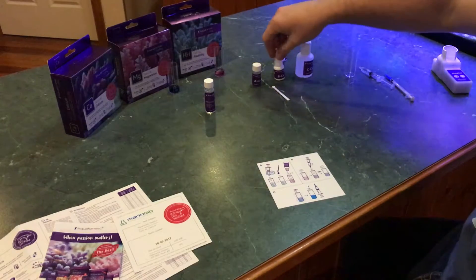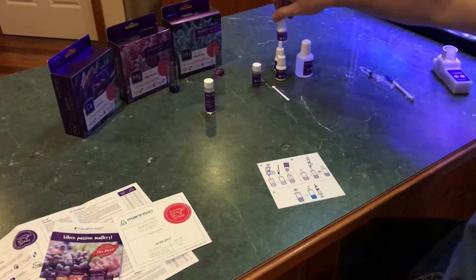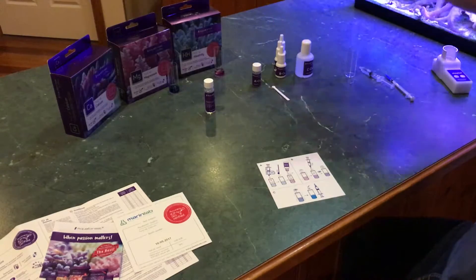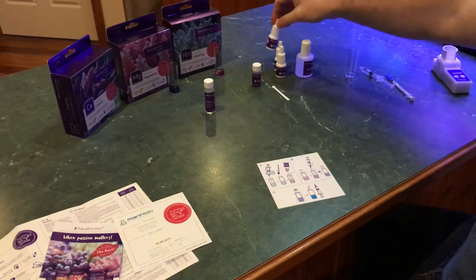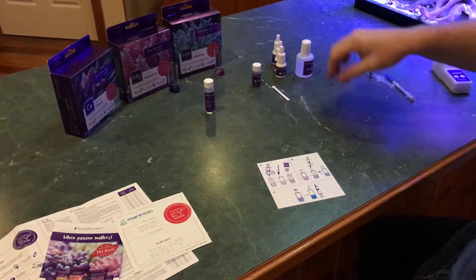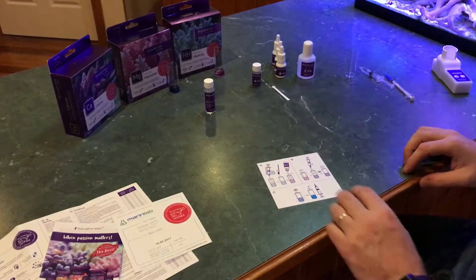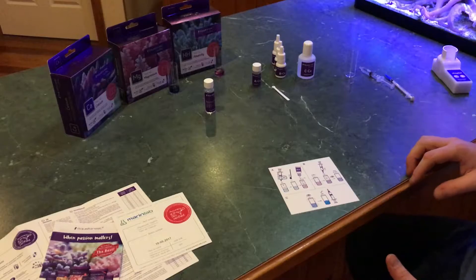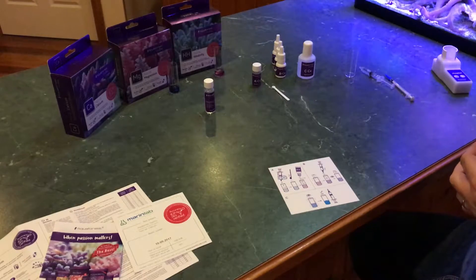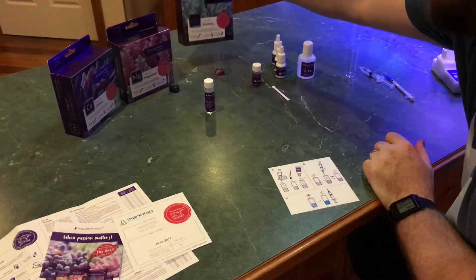Reagent A is a powder — you just get one of those. Reagent B you get three of, so again you can keep them fresh; they obviously suffer from some sort of variation when exposed to air, so this keeps them fresh. Bottle of C — I think it does say somewhere how many tests you're meant to get out of it: 55 to 65 tests. Wow, maybe I need to test more often than the alkalinity one which gives 78 to 100 tests.